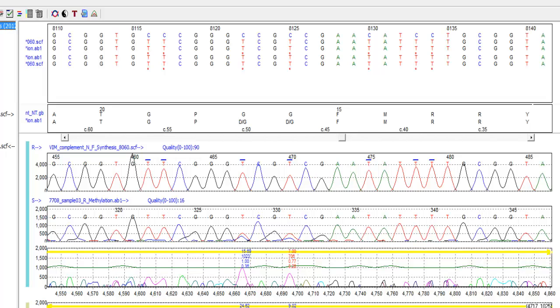We can also see from this example that the cytosine positions located within CpG dinucleotides remain marked as C in the reference trace, indicating that these positions are possible sites of methylation. The sample file displays cytosine nucleotides at these positions, indicating the presence of methylation.